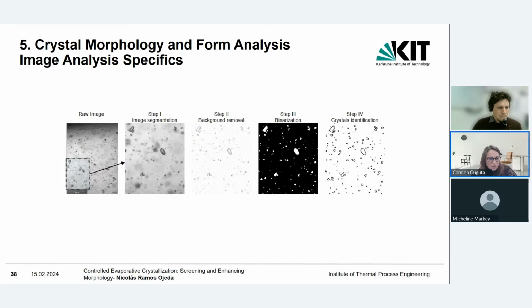Another question, Nicolás. For scale-up experiments in crystallization and polymorph preparation, what kind of variables did you face for consideration during your experiments? Does a multiplication factor merely work to scale up from milligram scale to gram scale to kilogram scale? Yeah, for scale experiments.